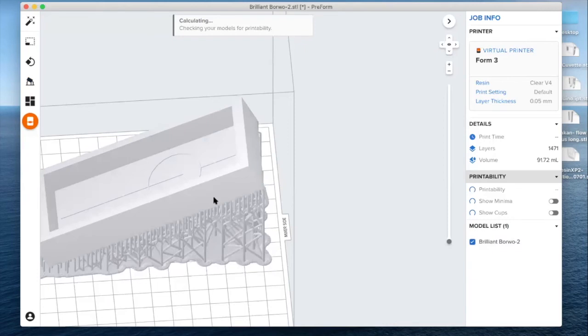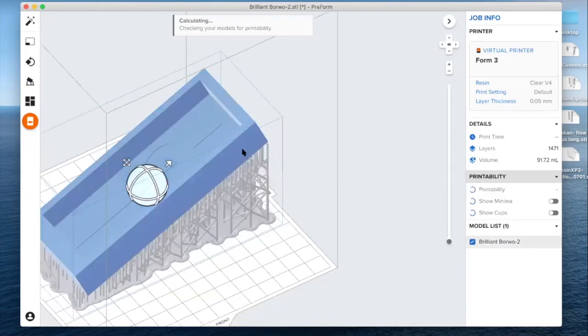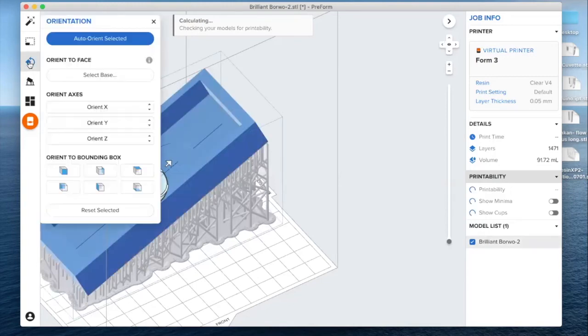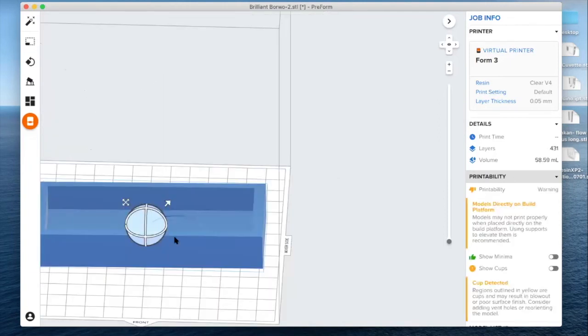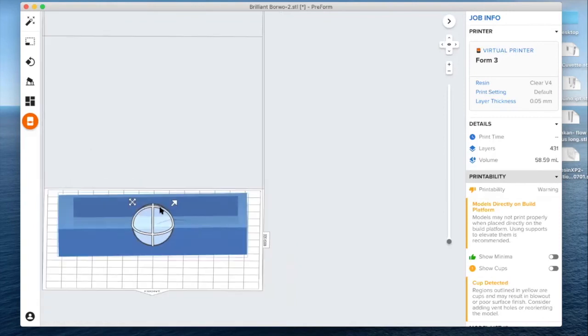The only important thing is that if you print it in this direction, most of the time it works, but the surface will not be completely flat because you will have all the layers in this direction. So when we are printing something for microfluidics, we actually print it flat. So you put this one completely flat on the bed plate. We still use the support because then it's easier to remove it.